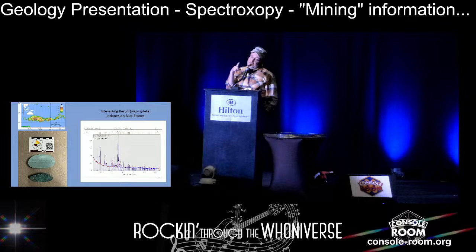So I've since X-rayed both of them, and what we've come up with so far is it's got quartz in it, which we expected. It's also got a zeolite mineral, which is often an alteration product of volcanic rocks, and a mineral called bornite. It's in both of them. So these probably came from the same volcano. I still don't know what the bluish-greenish color is, but I'm getting close.